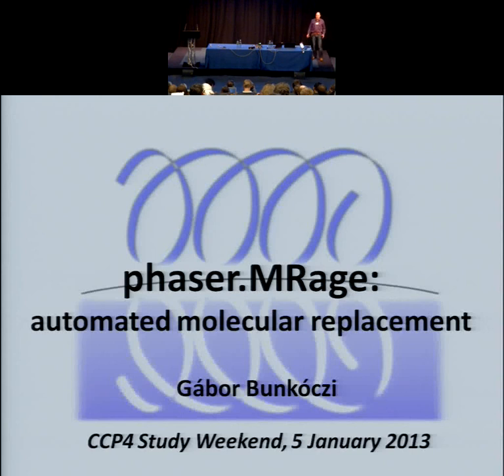So what I'm going to talk about is a program called Mirage. Well, I do realize that there are several readings of this character sequence, and this is the official one, but you are very welcome to call it any way you like. So what this does, it's an automated framework for molecular replacement.